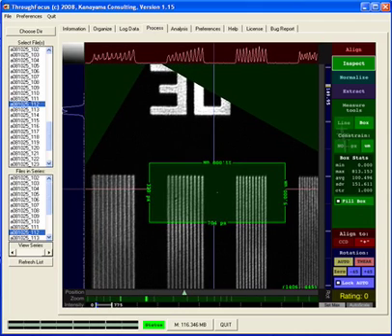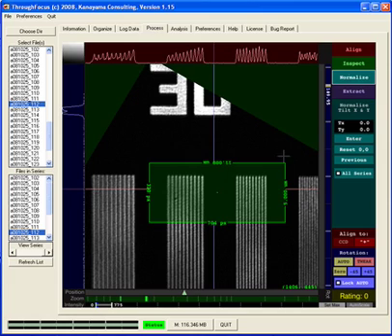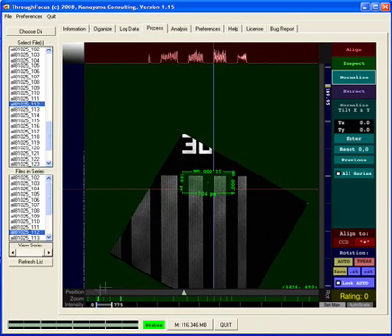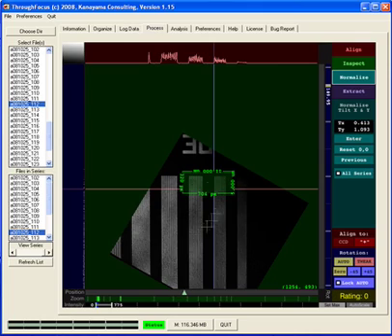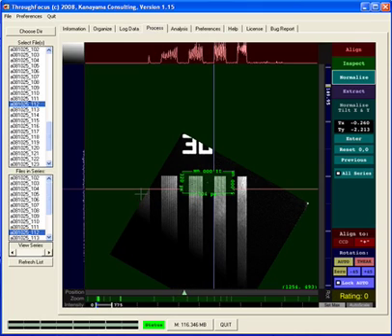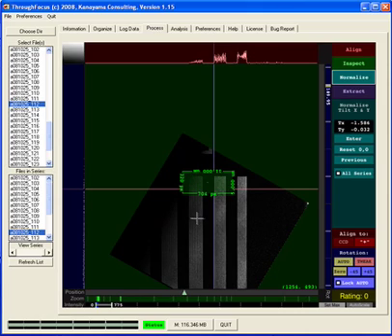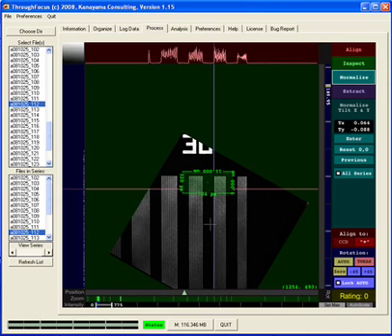Okay, so let's take a look at this normalize tool here. Now, normalize is designed to help you get the intensity to be a little bit more uniform. Now, if I use the shift click and drag the mouse around, you can see I'm adjusting the uniformity of the, or I'm correcting the uniformity in the illumination.